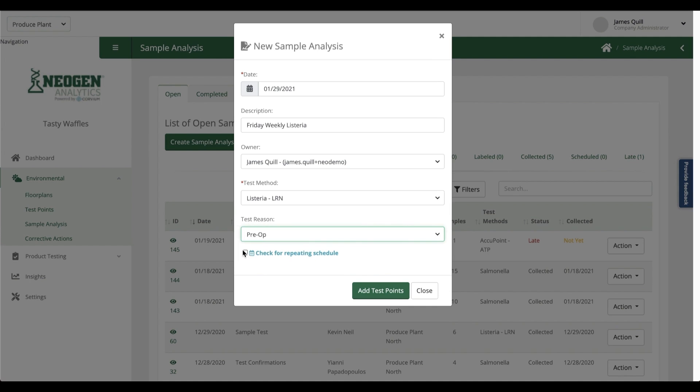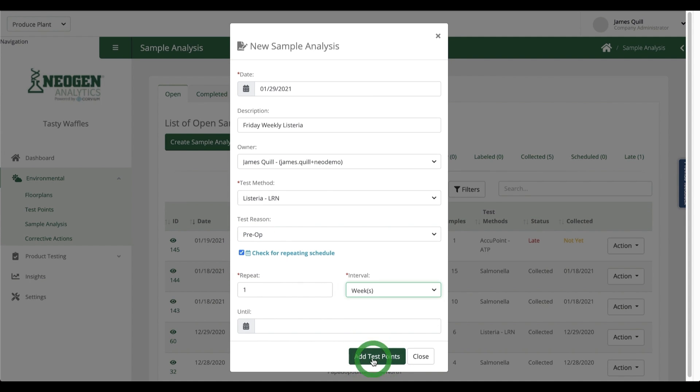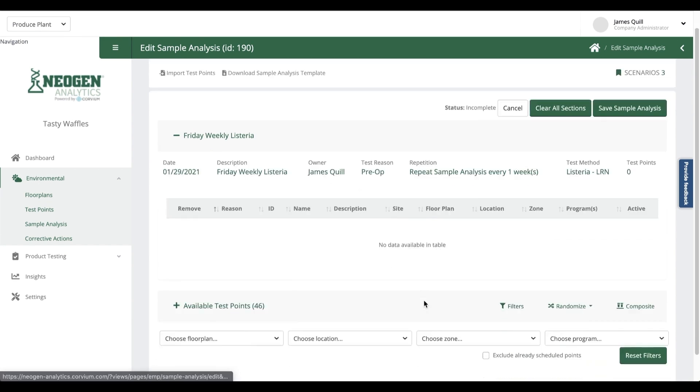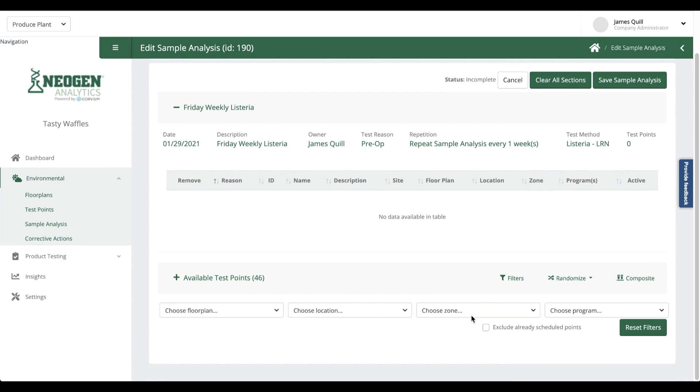I choose my weekly recurrence at the bottom, and then I'm going to select my test points. Now remember, I only want Zone 2s, and I need them to be randomly selected.